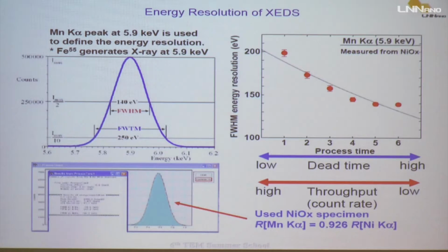Then we go to the resolution of the EDS, this kind of spectrometer. We are dealing with X-ray energy dispersive spectrometers.